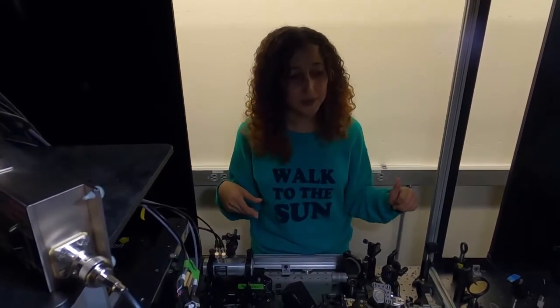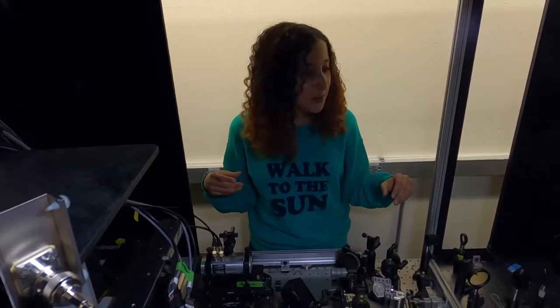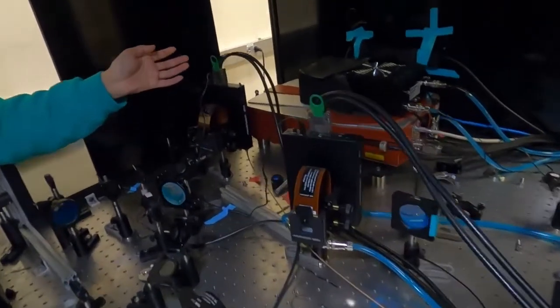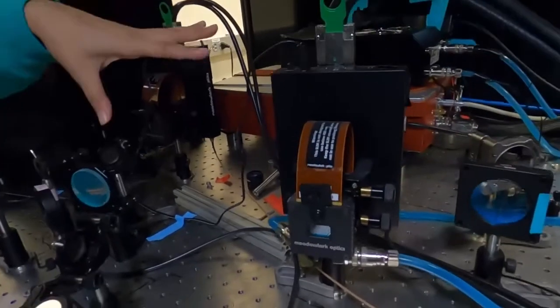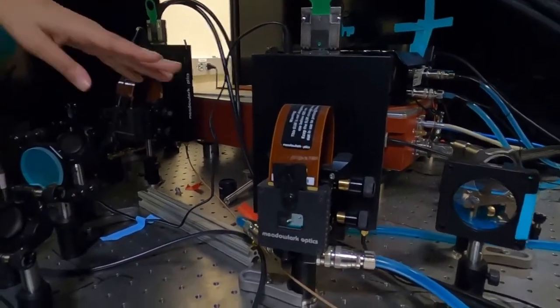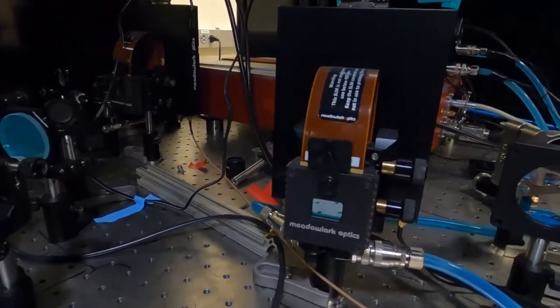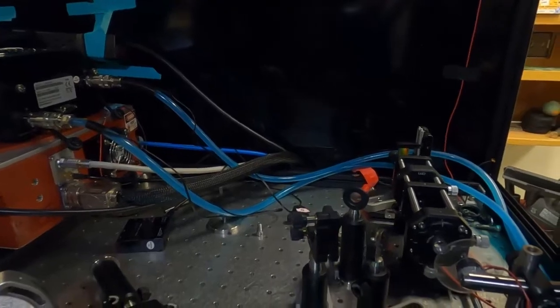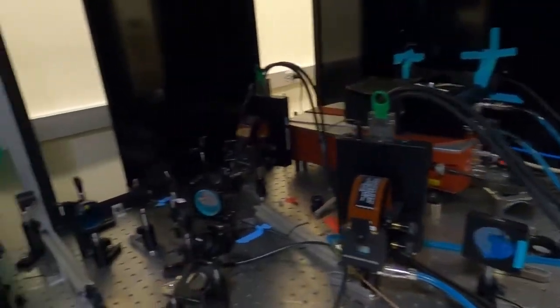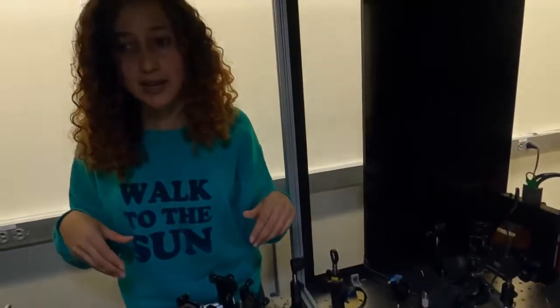So we can think of this system as basically a Swiss knife microscope for neuroscientists. So we have first our signature technology, which is 3D holography that we call 3D shot. The main part here is this spatial light modulator with high refresh rate together with the grating over there. And basically just a bunch of free light optics that allows us to generate user-defined 3D patterns of activity at the focus of the objective. And this is basically to manipulate neural activity.